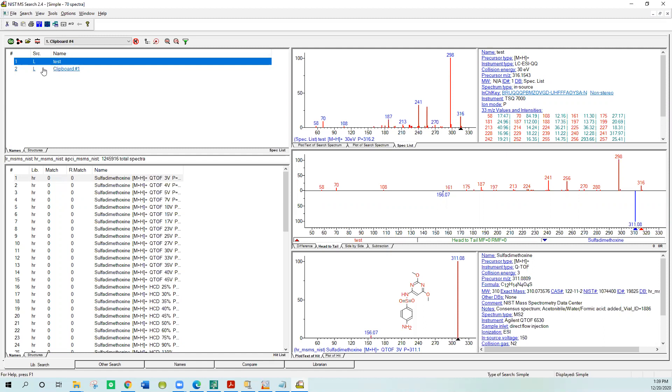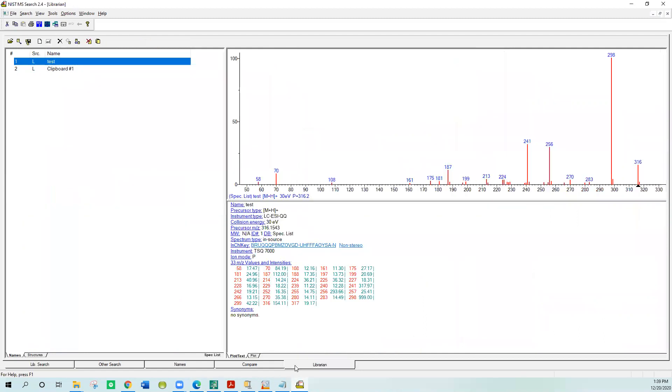The first thing you do is you have to go to the librarian folder down here. Let's go to the librarian folder. That's where all the things are added in. Down at the bottom here, librarian, and you'll see the test here. Before you edit it, though, we do need a structure.